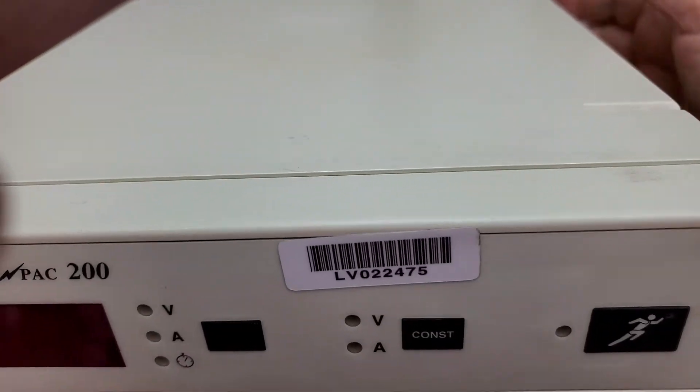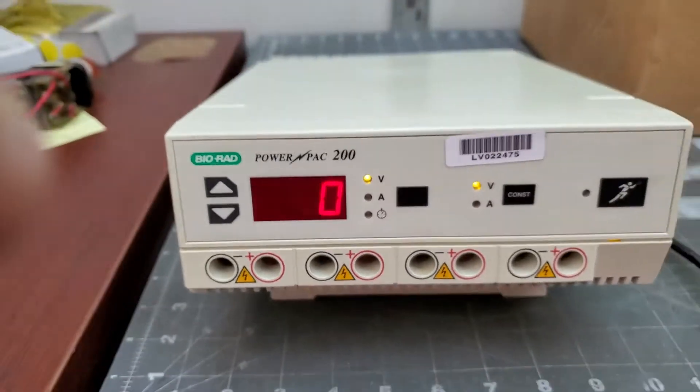I don't know how to operate it, but I know how to turn it on. That's it on.